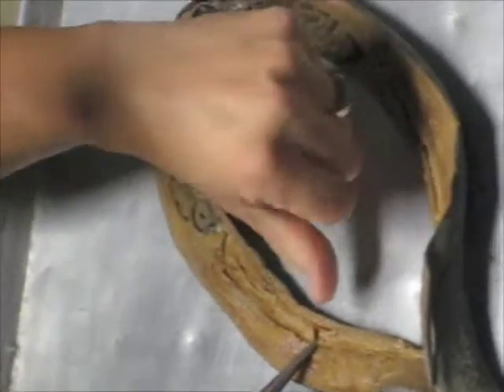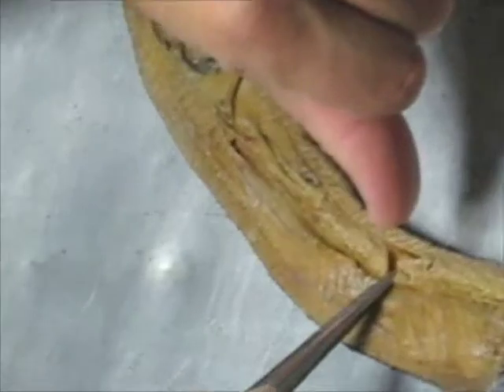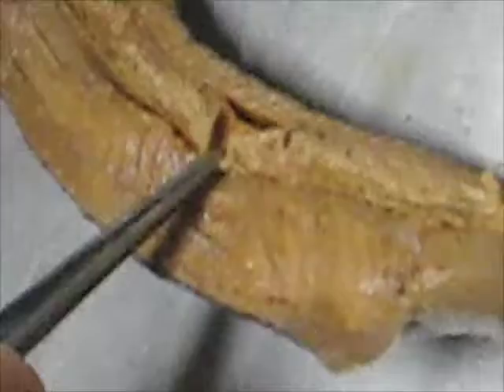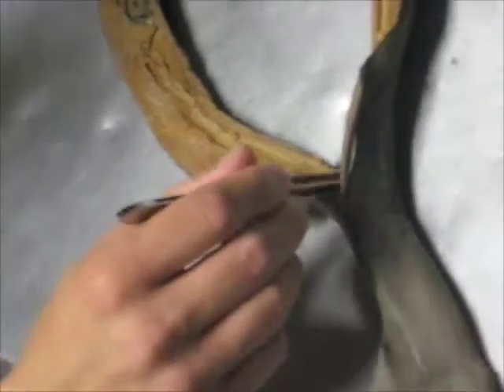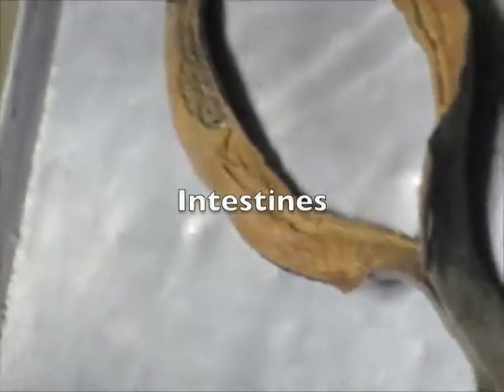If we look over here on this side, if you're looking at the picture, I'm holding the testes and the little flap that you see coming up right there, that's kind of making the little mouth. That is the testes right there. Kidneys, thank you. And then here's part of the intestines. So I think I hit everything.